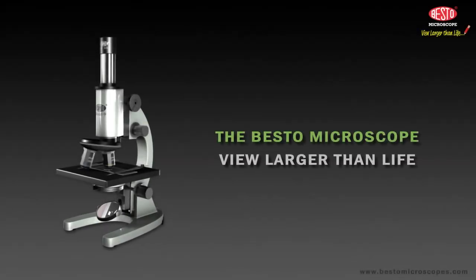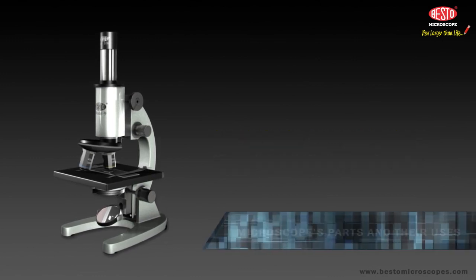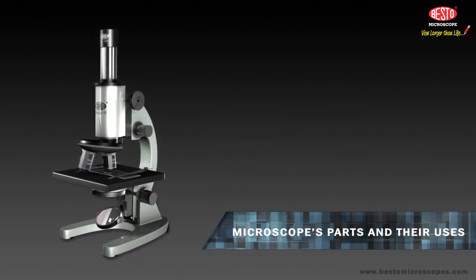View larger than life. A practical introduction with projects and activities. Microscope's parts and their uses.